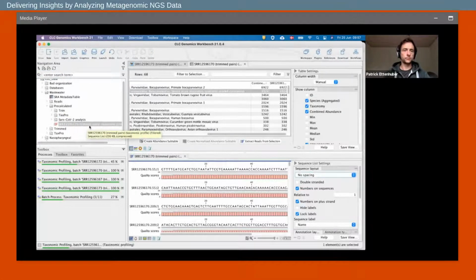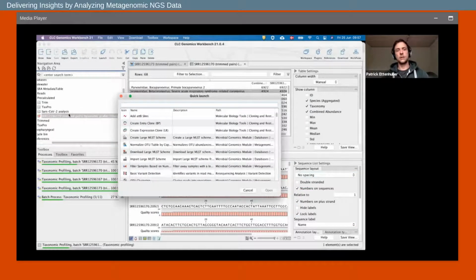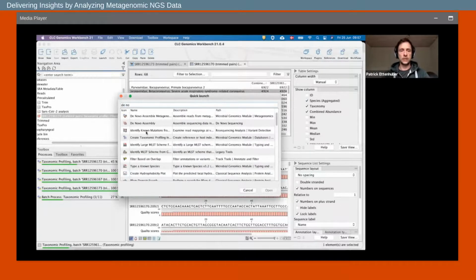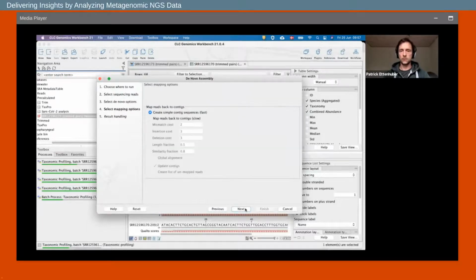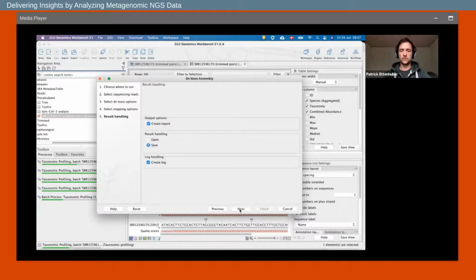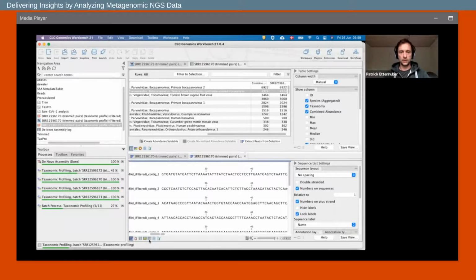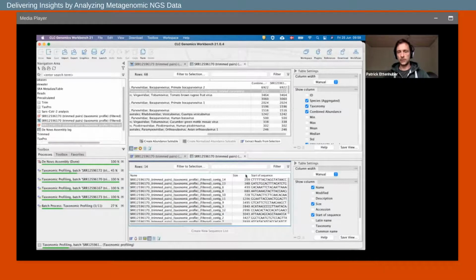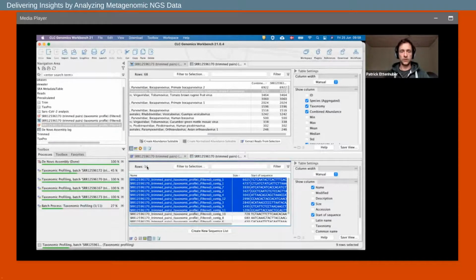case. So we have these filtered reads, and then we can say the Denovo Assembly, select those, keep all the parameters at default. We'll choose this fast route, and then we'll see. Oh, this is already done. Briefly look into it, and then we can see, okay, there are a few bigger contigs and some smaller ones, but all in all 14 contigs. As I said, we'll later analyze those a bit further.